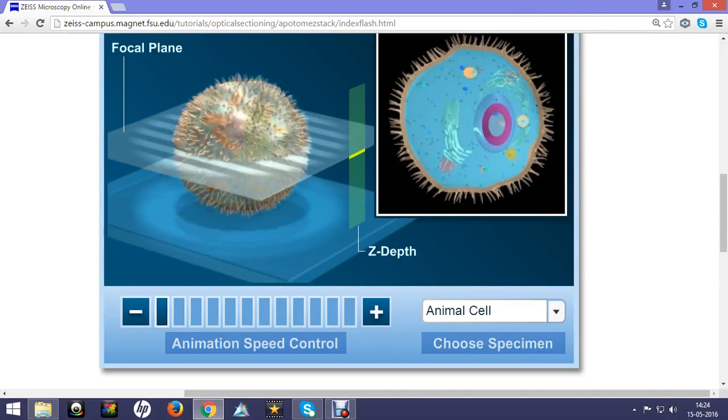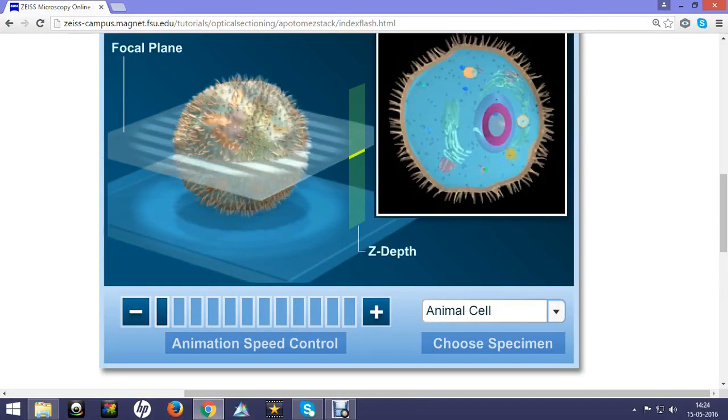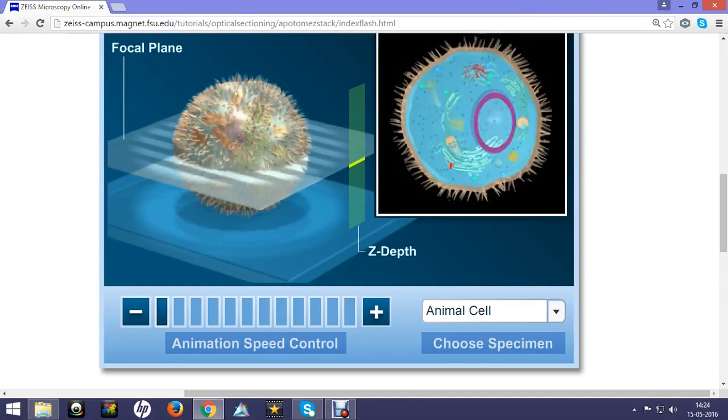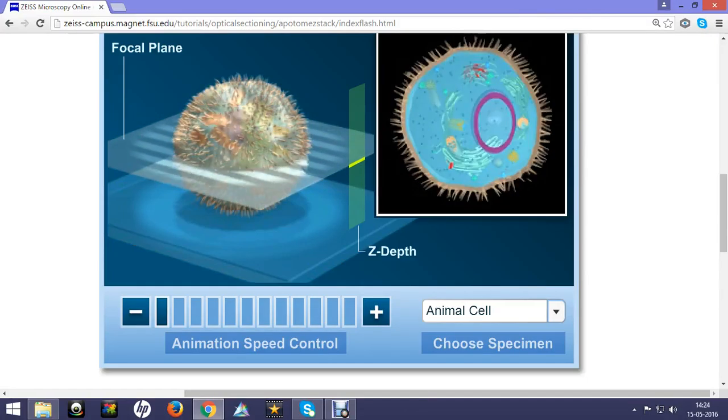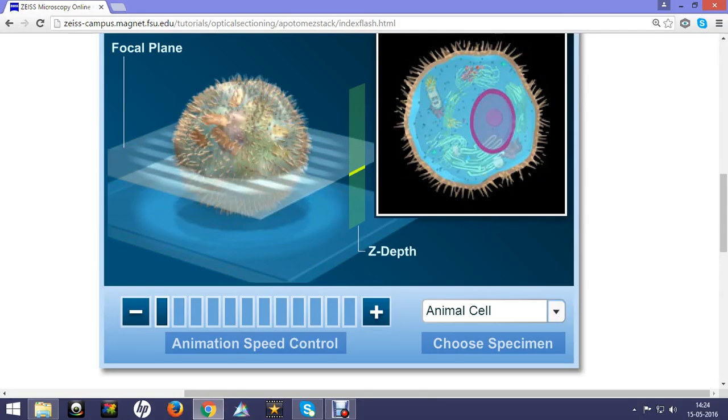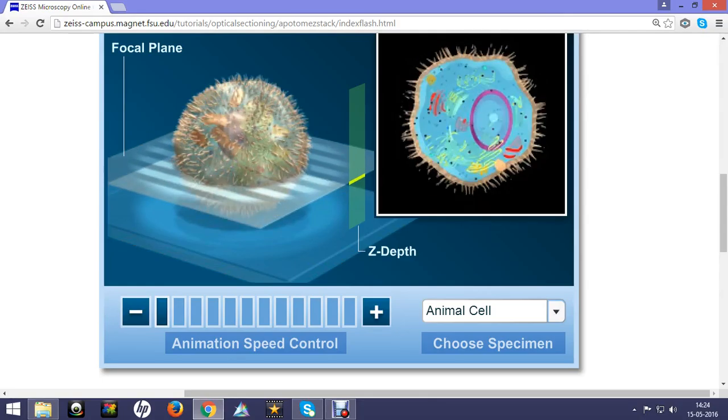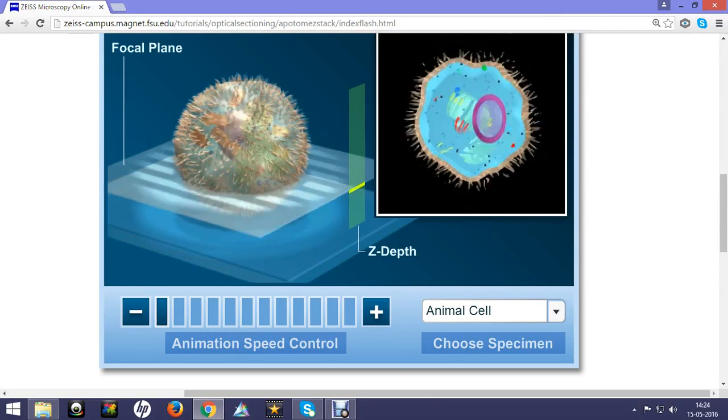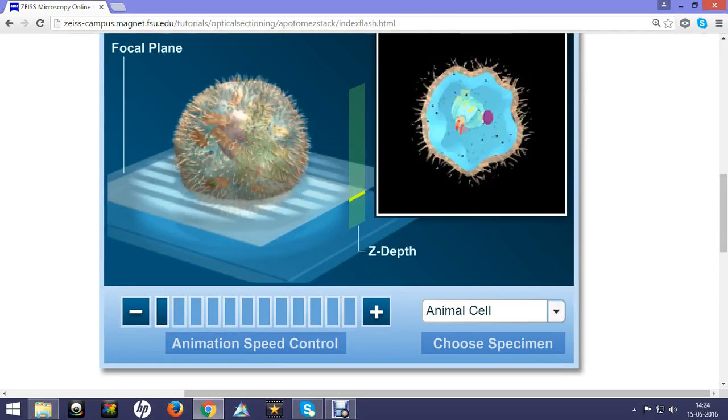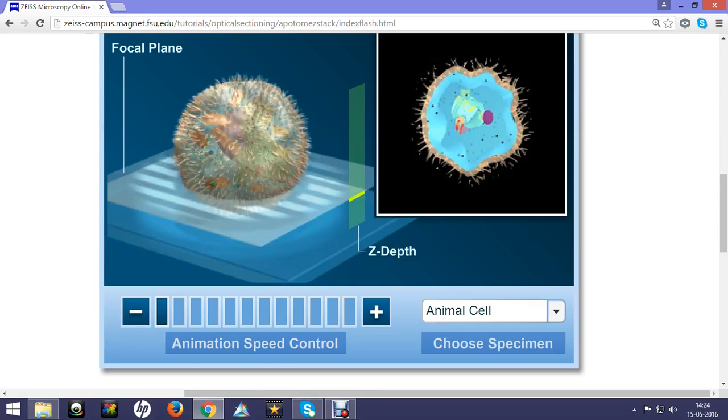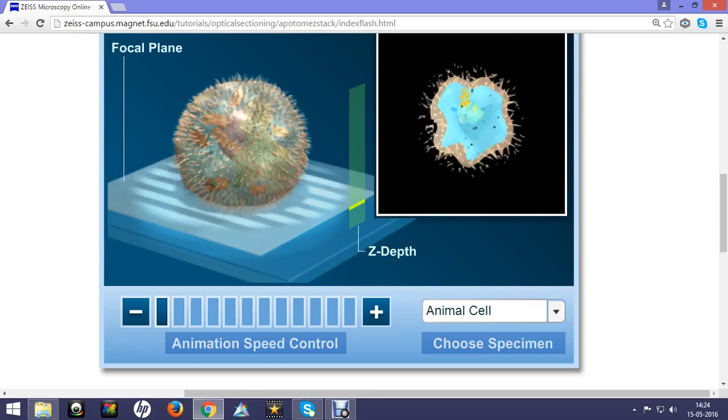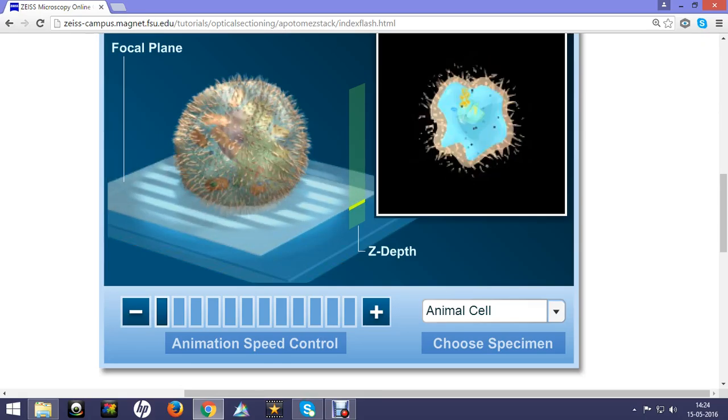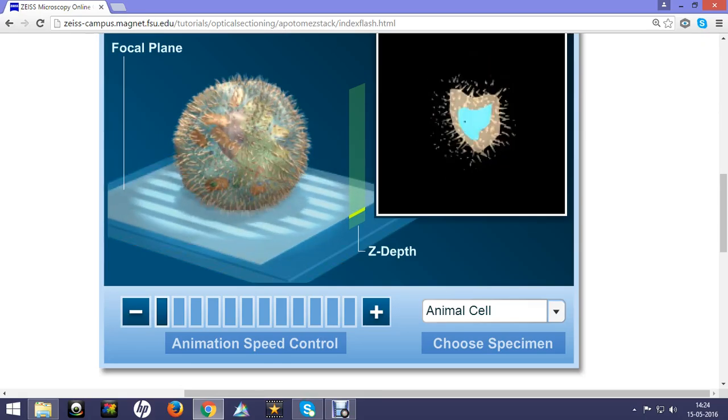Hi, in this video I'm going to demonstrate the optical sectioning property of our confocal microscope or any good kind of apotome microscope. On the left hand side you can see there is an animal cell and on the right hand side in the inset you can see the cross sectional view.